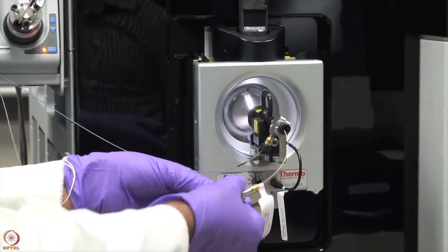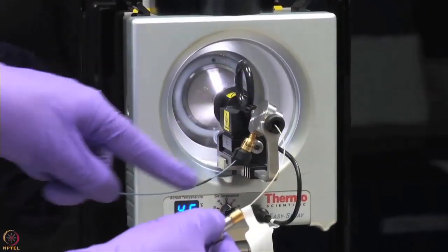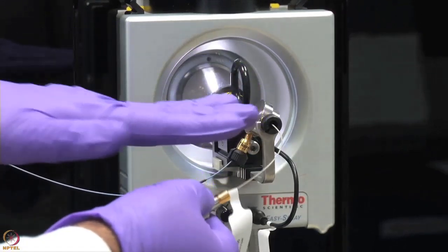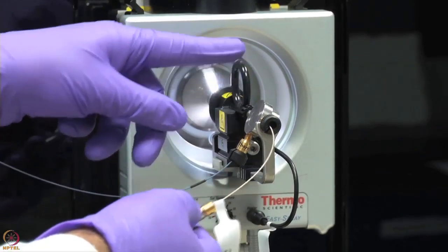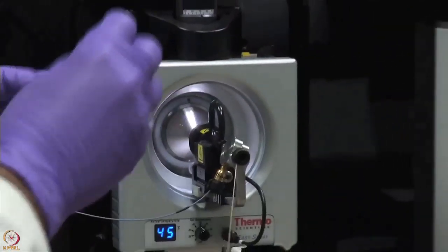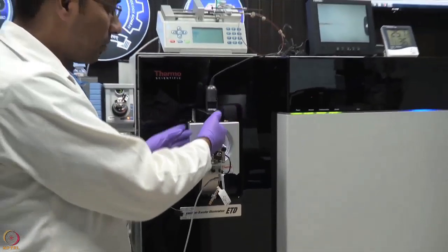Basically desalting, and your peptide will start to bind in this column, and then waste will go through this tube into a waste beaker. Once your sample has been cleaned in the pre-column, it will pass through the second column, which is the analytical column, and start to fractionate. Slowly the first hydrophilic peptides will start to elute, and then hydrophobic peptides will start to come.